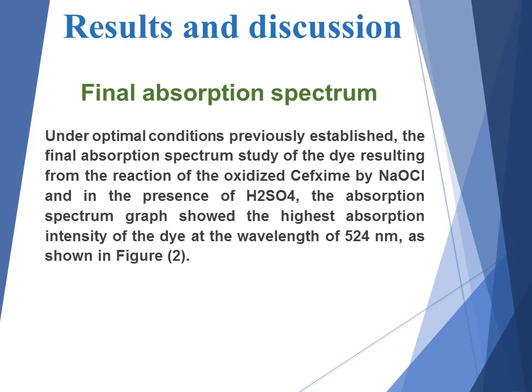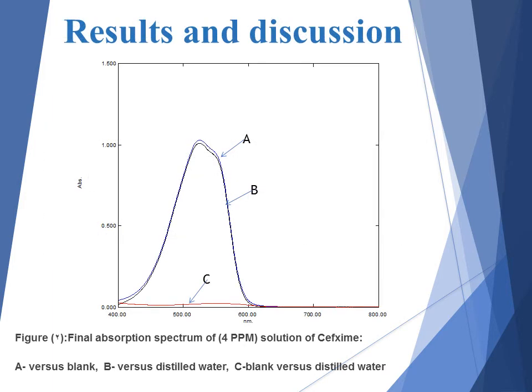Final absorption spectrum. Under the optimal conditions previously established, the final absorption spectrum of the dye resulting from the reaction of cefixime oxidized by sodium hypochlorite in the presence of H2SO4 was studied. The absorption spectrum graph showed that the highest absorption intensity of the dye is at the wavelength of 524 nanometer as shown in figure 2. Figure 2, final absorption spectrum as shown in the slide.